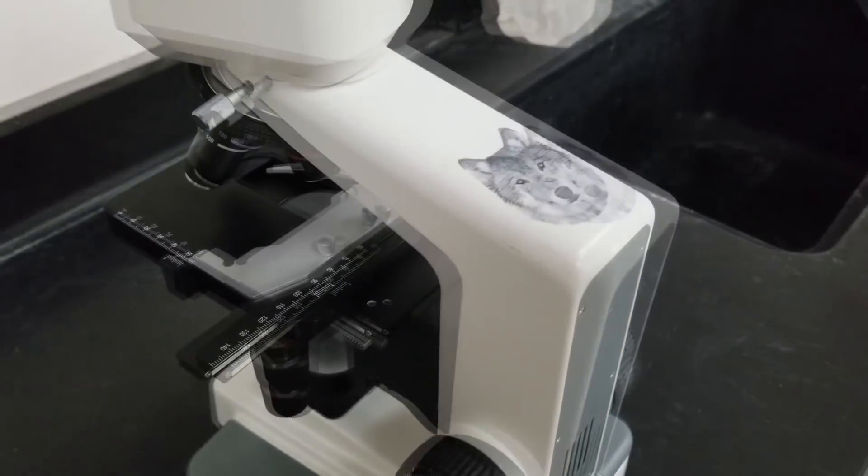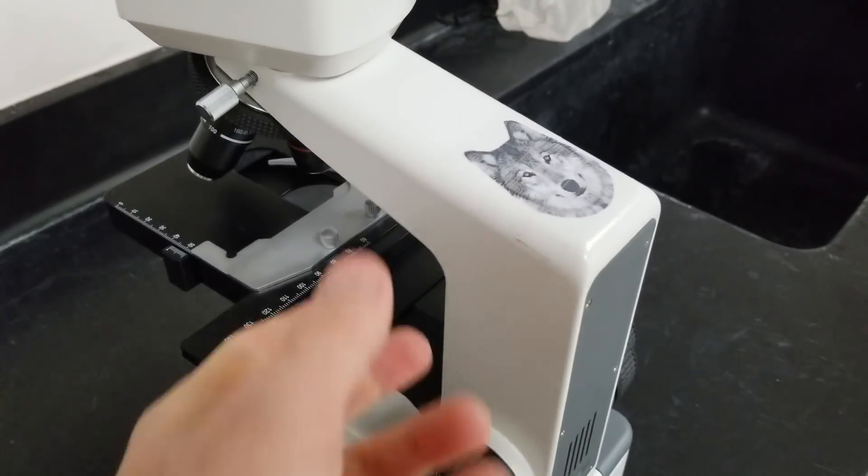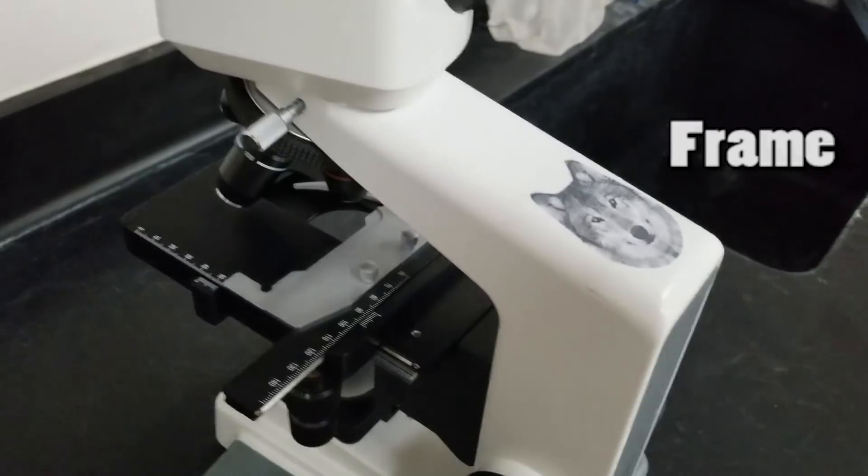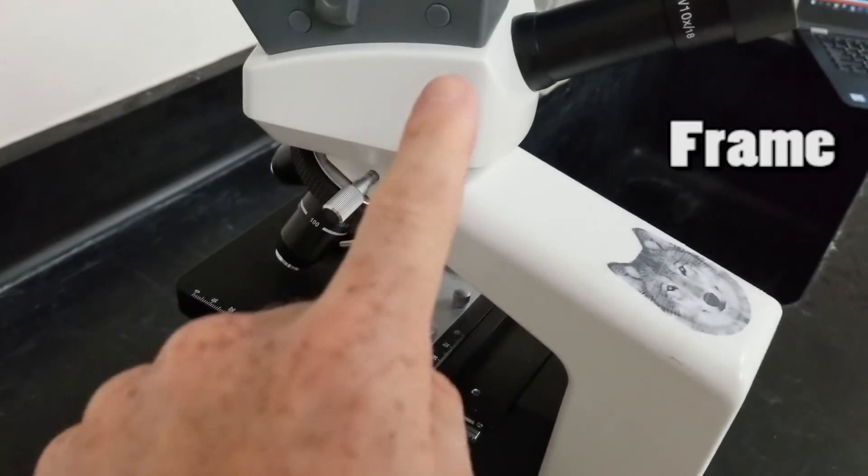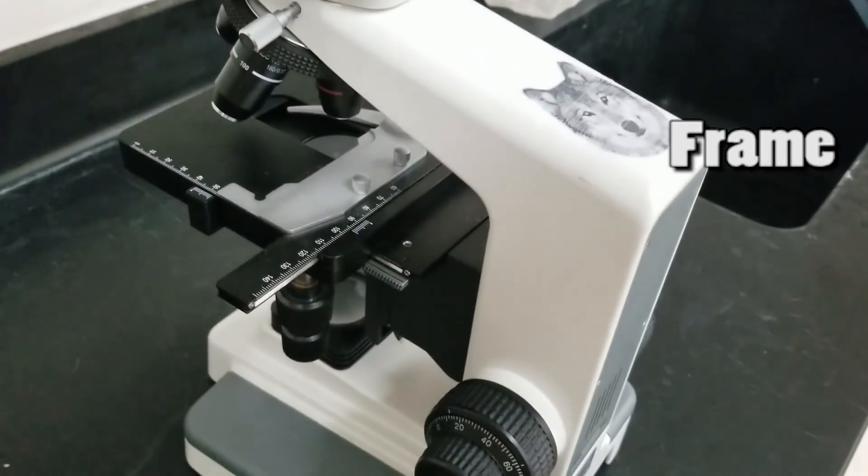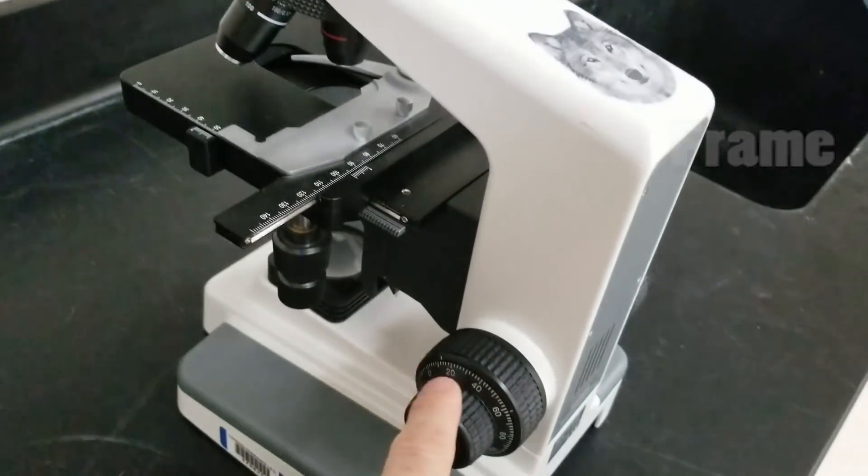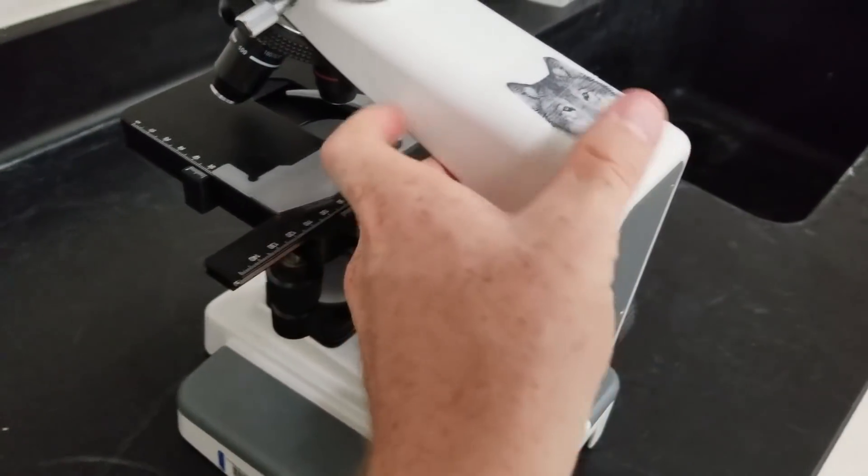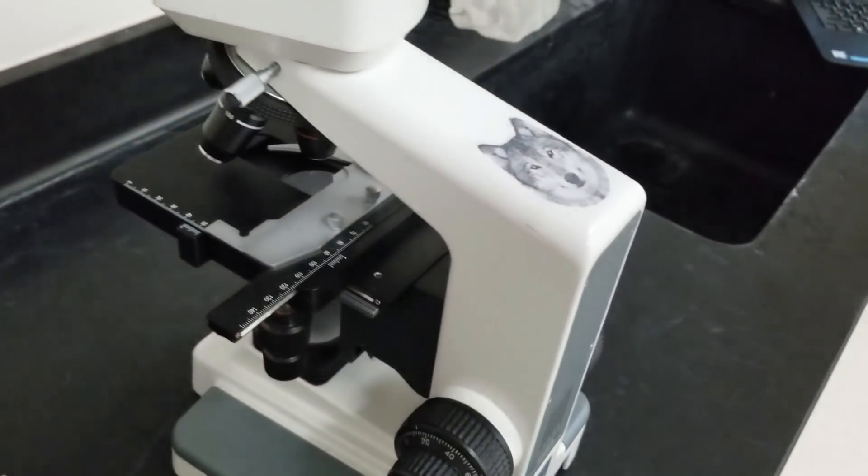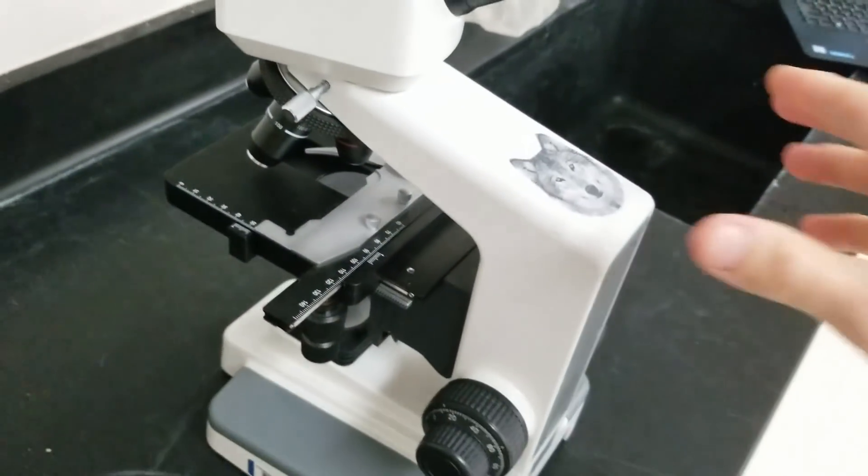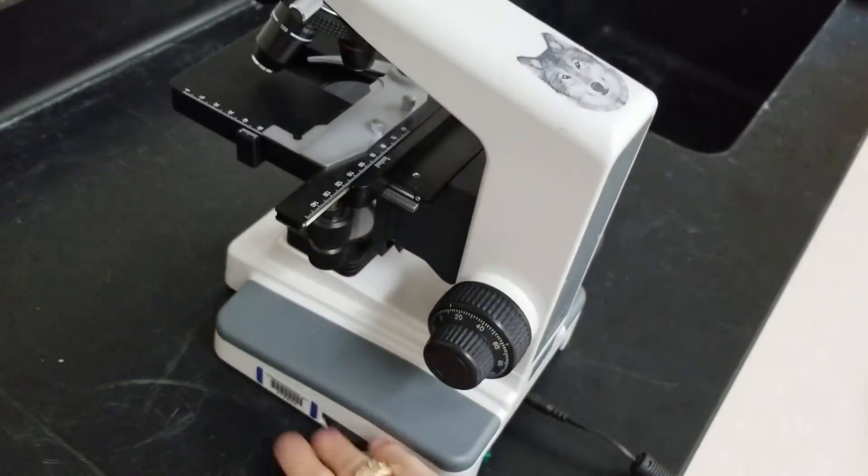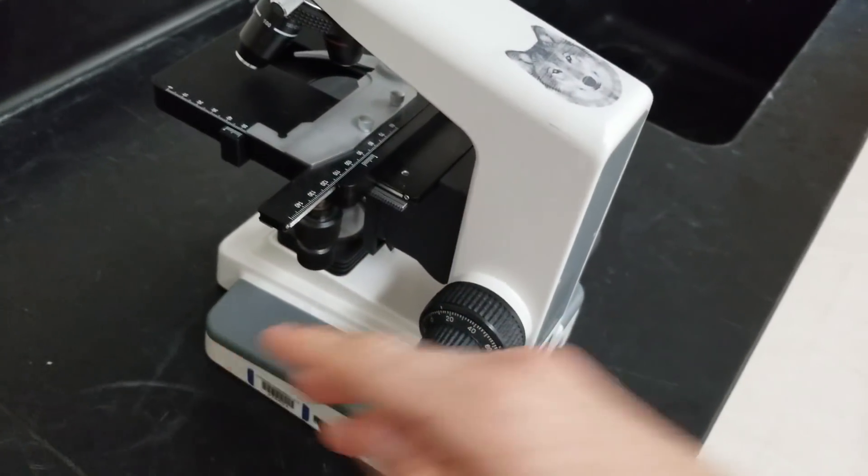Once you have the objective clicked in, it should be able to focus. The frame connects the head all the way down to the base and then goes down to the knob. When you're carrying it, hold it with one hand on here, one here and down here.